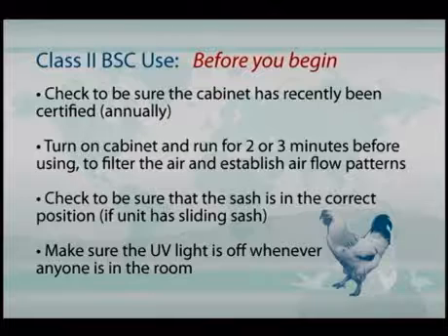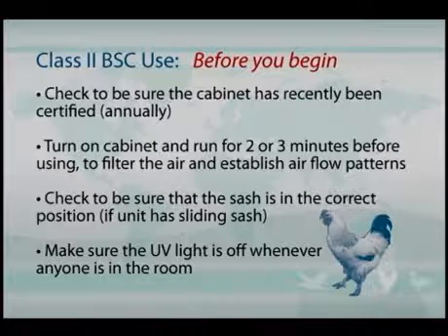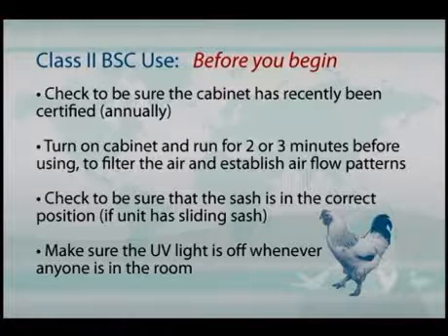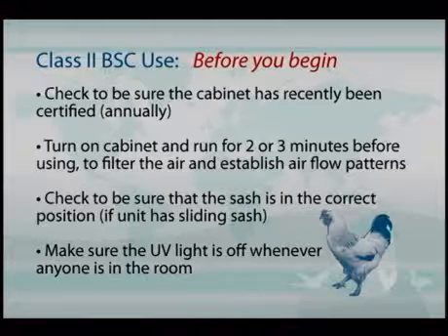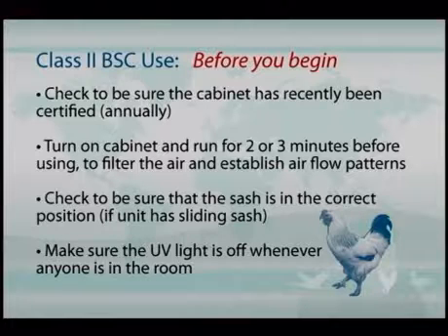These cabinets should be turned on for a few minutes prior to their use to establish clean air and to establish the airflows within the cabinet. Some cabinets have a movable sash that has to be in the correct position to allow the appropriate amount of air to enter the cabinet, and usually they will have a buzzer or a beep to indicate when the sash is in the correct position.